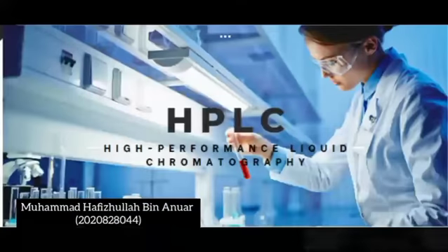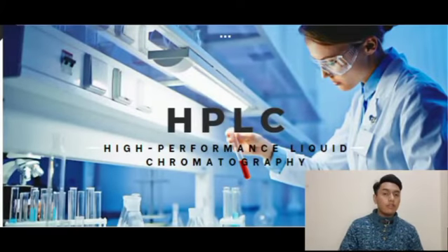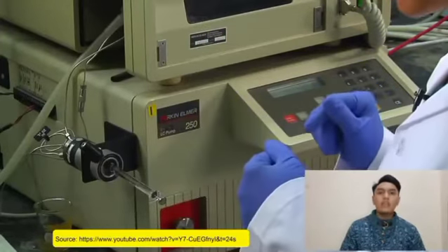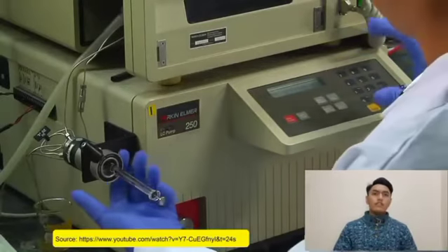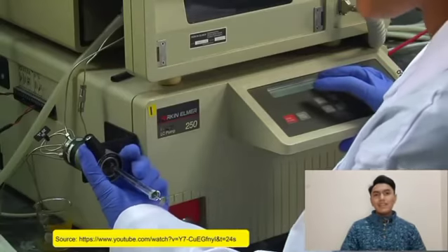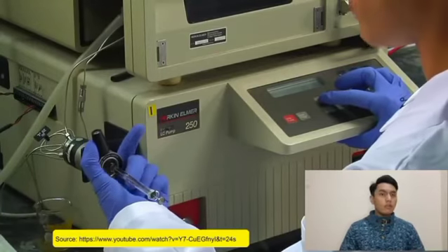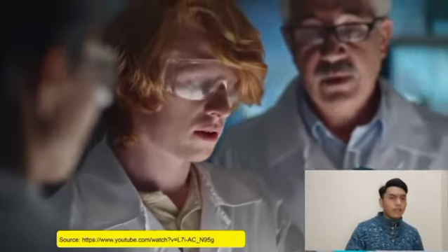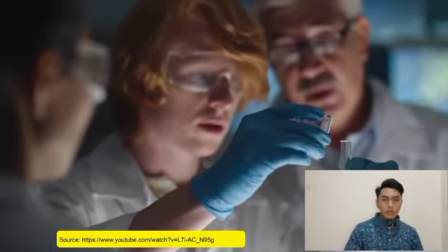What is HPLC? HPLC stands for High Performance Liquid Chromatography. HPLC is an instrument using chromatographic technique to separate a mixture of compounds. HPLC is a very powerful instrument used in biochemistry and analytical biochemistry because it yields high performance and high speed compared to traditional chromatography. HPLC is used to identify, quantify, and purify the individual components of the mixture.